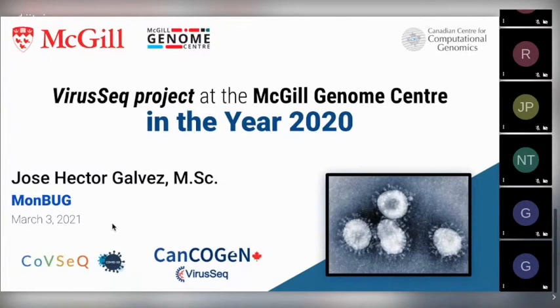For those of you that don't understand French, I'm just going to repeat a little bit. I'm a bioinformatics analyst at the Canadian Center for Computational Genomics at McGill. And I'm going to talk about the VirusSeq project at the McGill Genome Center, which is a project that is ongoing and that is related to the COVID sequencing effort that is a part of CanCOGen at a Canadian level, supported by Genome Quebec and by several other funding partners.